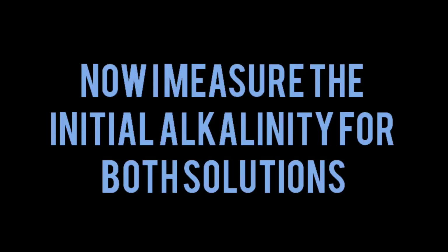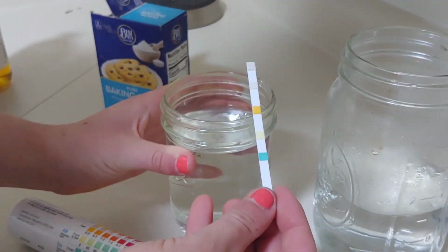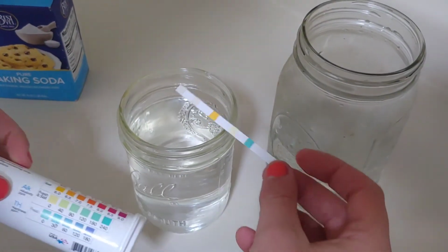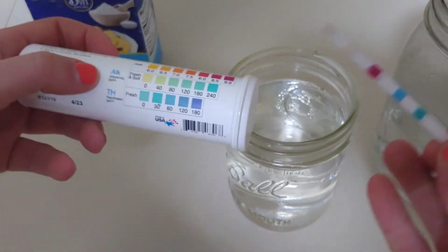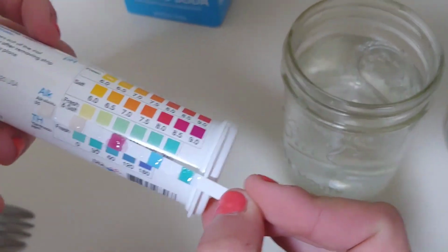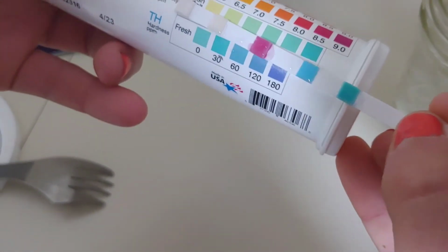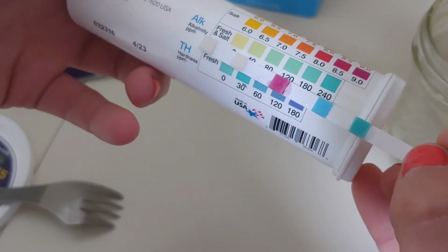Okay, so here is the alkalinity test strip, and we're going to dip it into this water, swirl around twice, and then immediately read the alkalinity measurement. So 1, 2, and then I'm going to take it out, and it looks like it says maybe 240. It's very blue. So yeah, I think 240.